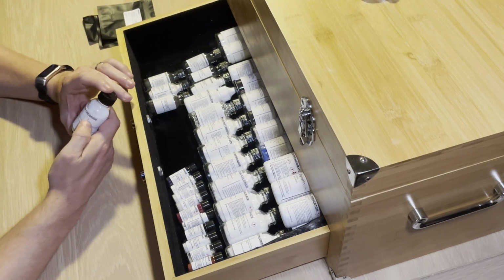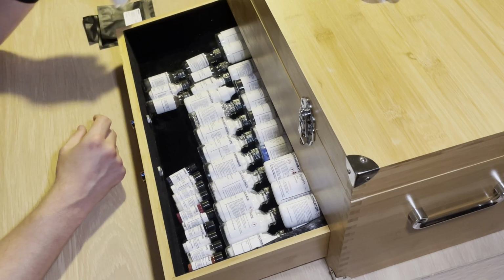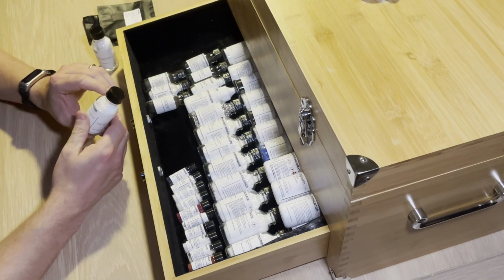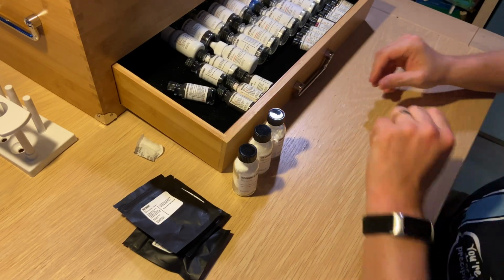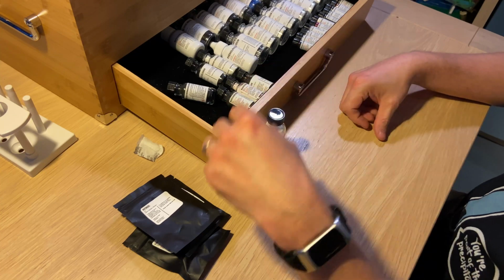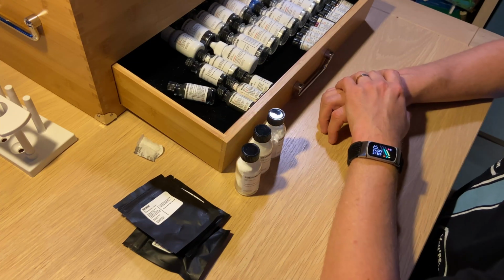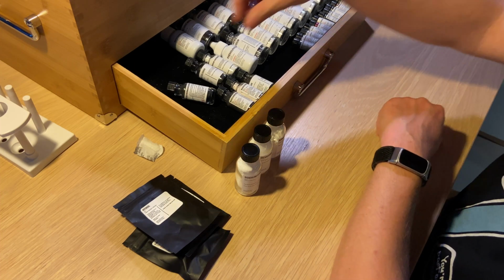Then we got sodium chloride. Yeah, table salt. You can wonder whether that is glucose. Sure. And then we have starch. Okay, so basically your typical household items. My wife will be very pleased that these things are now in my chemical kit and I don't have to constantly get those from the cabinets in the kitchen.